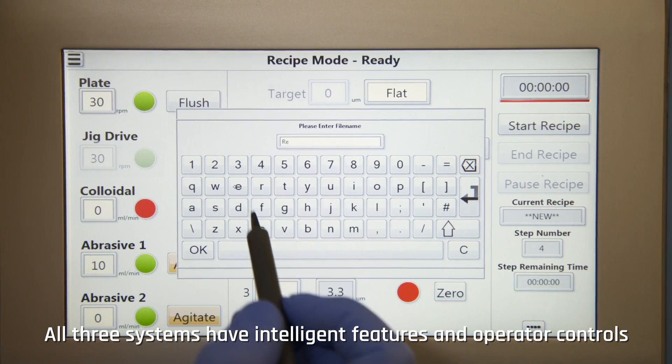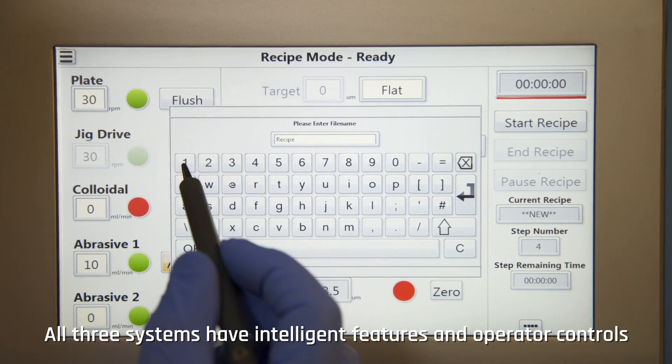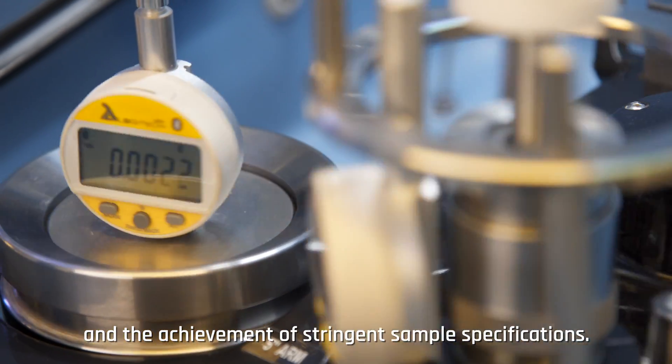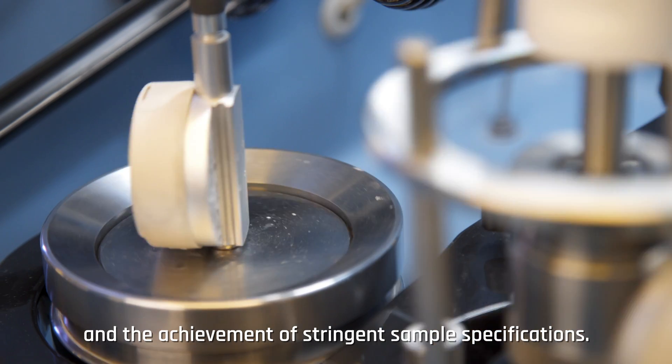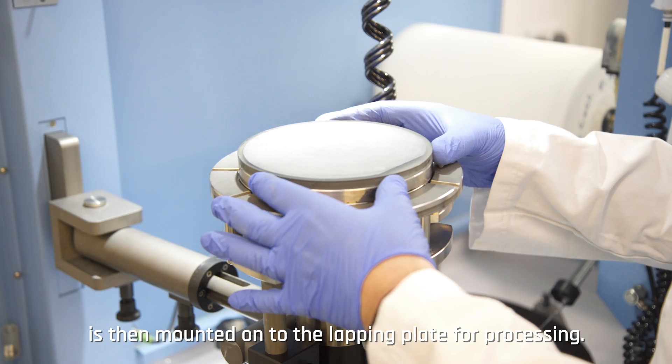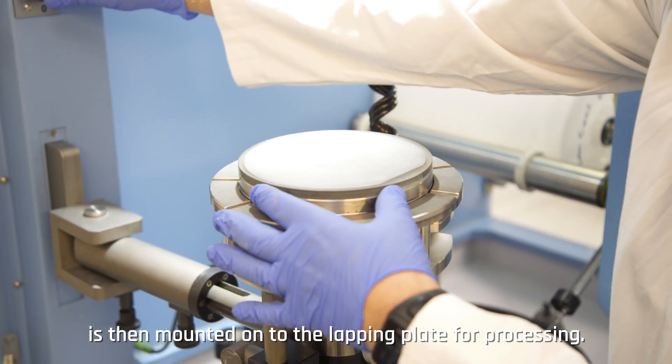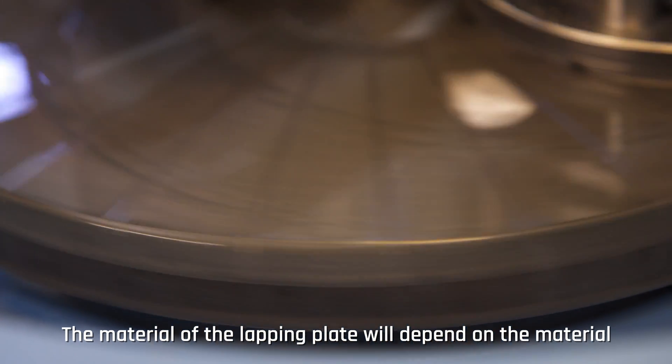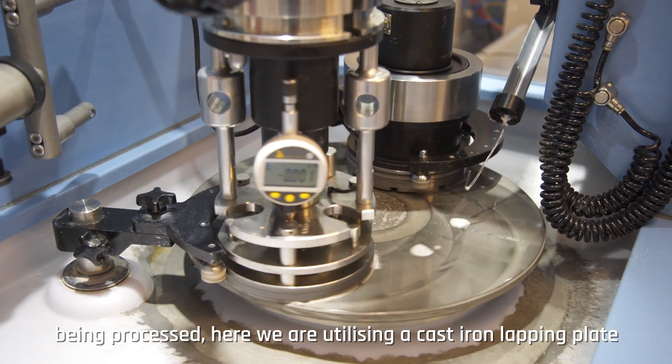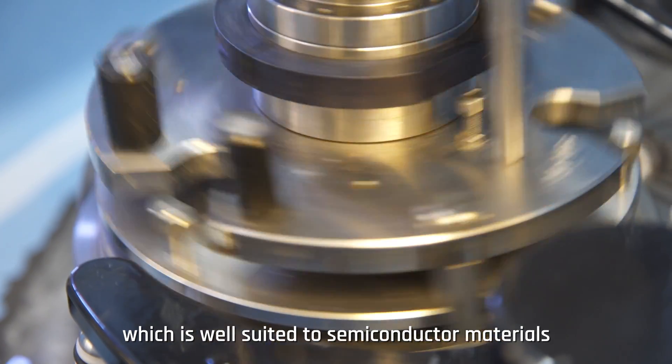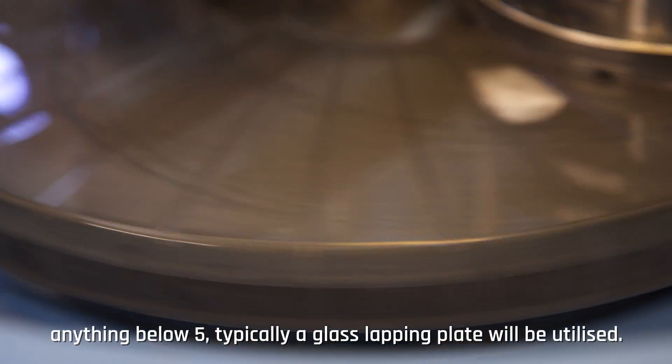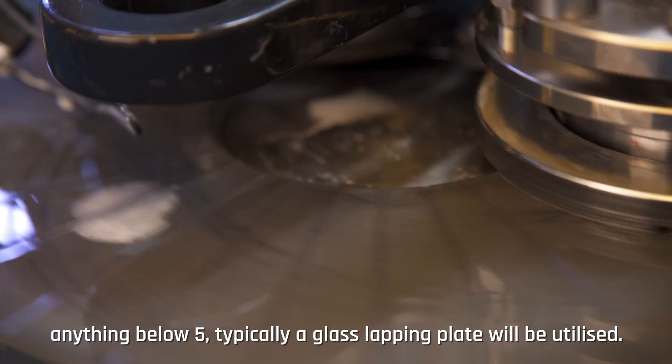All three systems have intelligent features and operator controls that allow for semi-automated processes and the achievement of stringent sample specifications. The sample held onto a Logitech precision jig via vacuum is then mounted on the lapping plate for processing. The material of the lapping plate will depend on the material being processed. Here we are utilizing a cast iron lapping plate which is well suited to semiconductor materials with a Mohs hardness of 5 or above. Anything below 5 typically a glass lapping plate will be utilized.